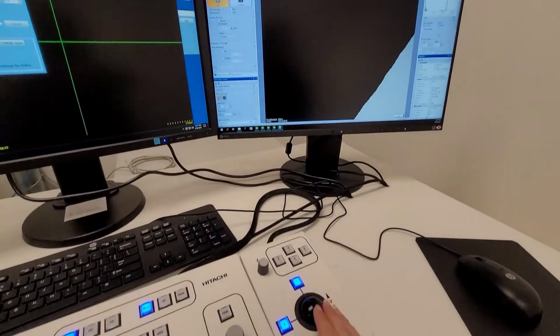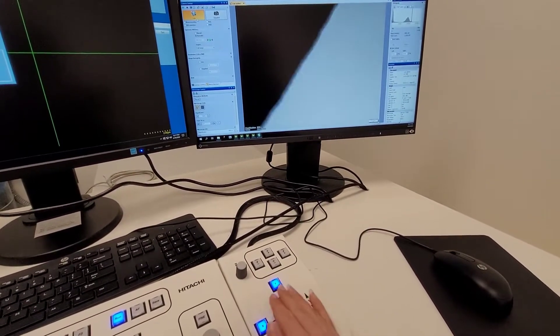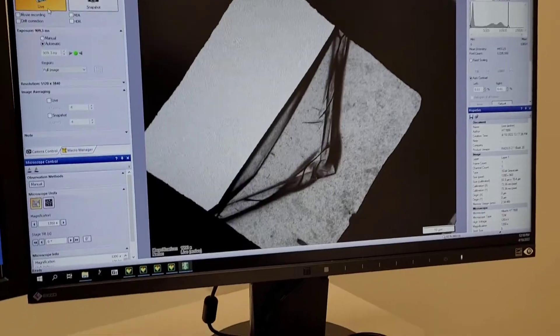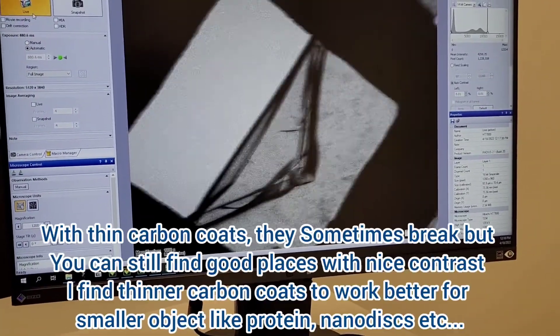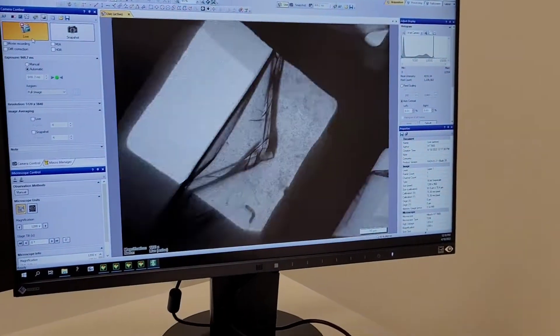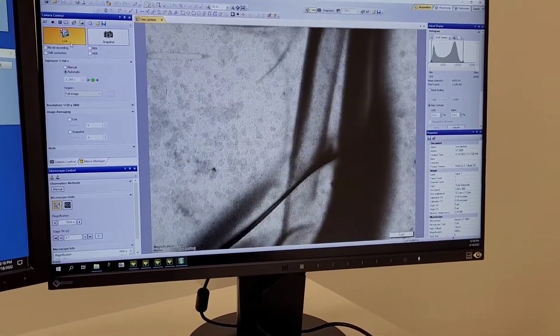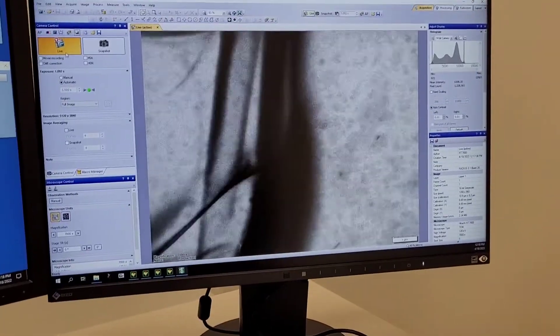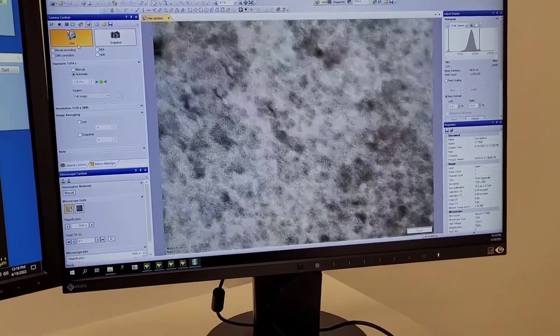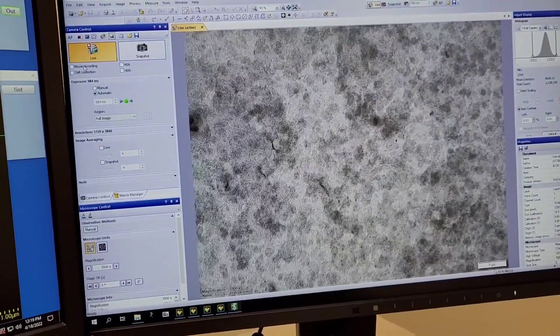Now you can just move around on the grids, zoom in and change the focus to take your desired images. In general, taking good TEM images requires practice and trial and error to figure out what works best for your sample, what kind of stain is best and what kind of carbon thickness on the grids. All these factors will affect how and what you can see.